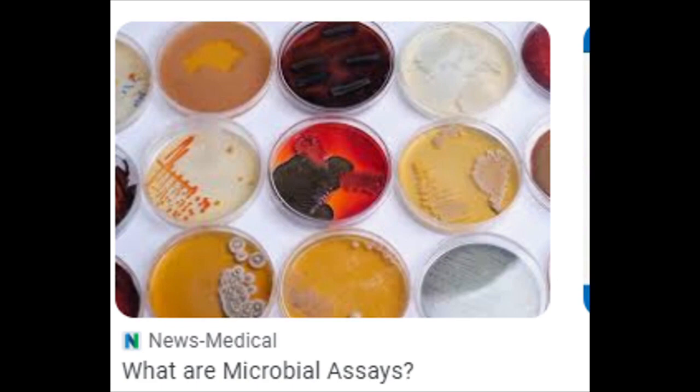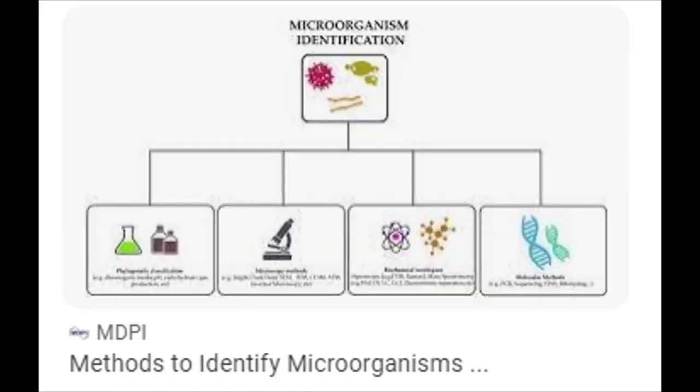A number of methods have been developed which aim to give answers more quickly and hence are often referred to as rapid methods. What did I call it? Rapid methods. Can you say that?